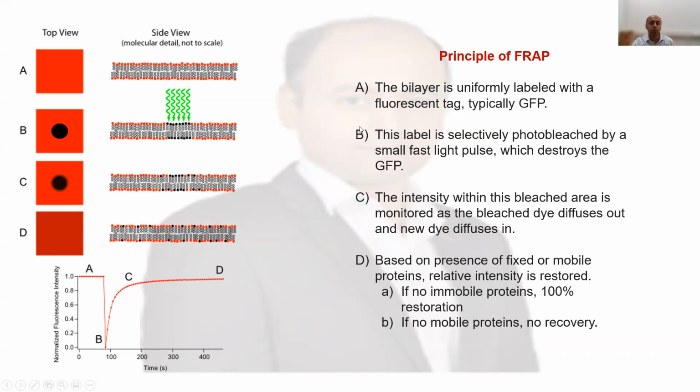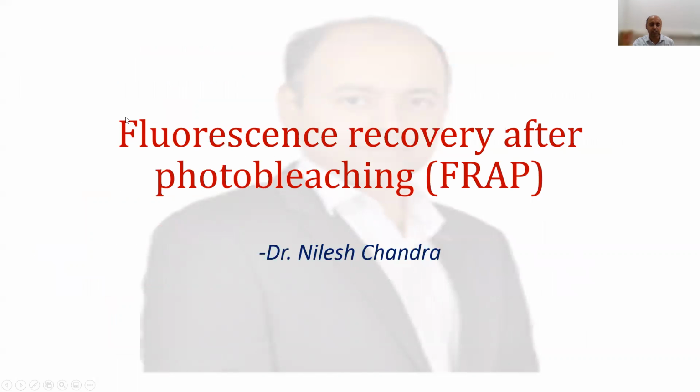That is why it is called fluorescence recovery after photobleaching. The name is fluorescence recovery after photobleaching. This tells us about the movement of the lipids and the proteins in the lipid bilayer.